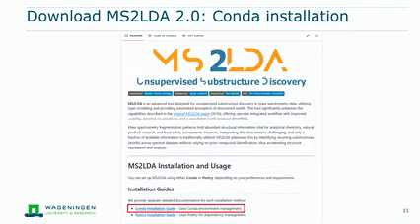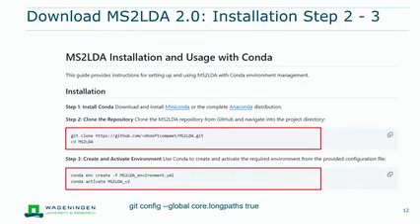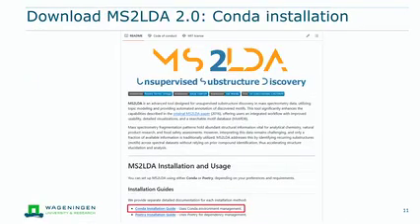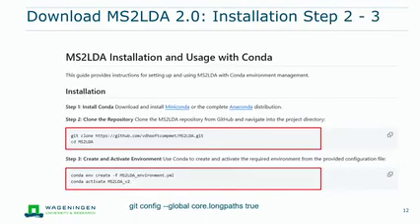So if you all typed in the GitHub link, then you scroll down, as I said, there's an installation guide for Conda. You click on this link, and then you follow step 2 and 3. Just to do it again, you're on the GitHub repository webpage, on the start page. You scroll down, there's a Conda installation guidance, and do step 2 and 3. If you are at home and you don't have Conda installed or Python, you can use the first step as well, but I think for the workshop that would take a little bit too much time.